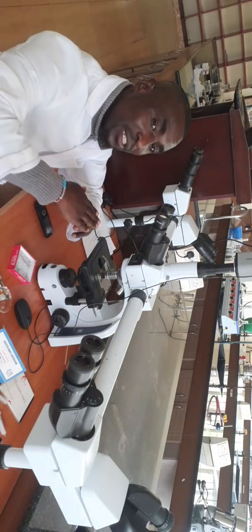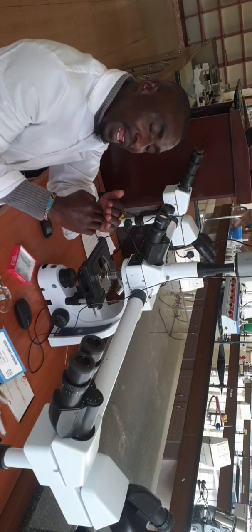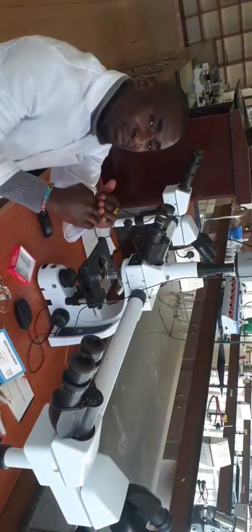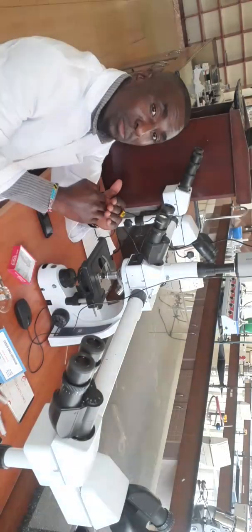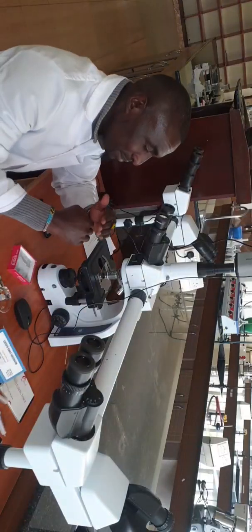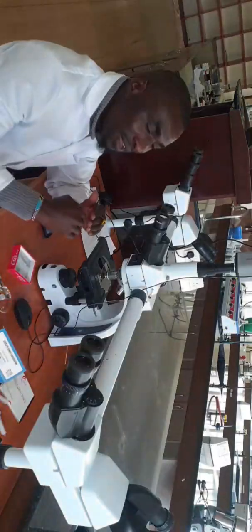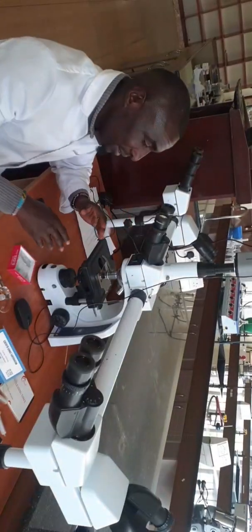It ensures that the specimen, the lens and the slide are in contact. And at that moment, never use the coarse adjustment knob to lower or raise the stage, because you will break the slide. So any specimen you are observing at times 100, use only the fine adjustment knob. Use the fine adjustment knob and you observe the specimen at its required size as per the lenses.